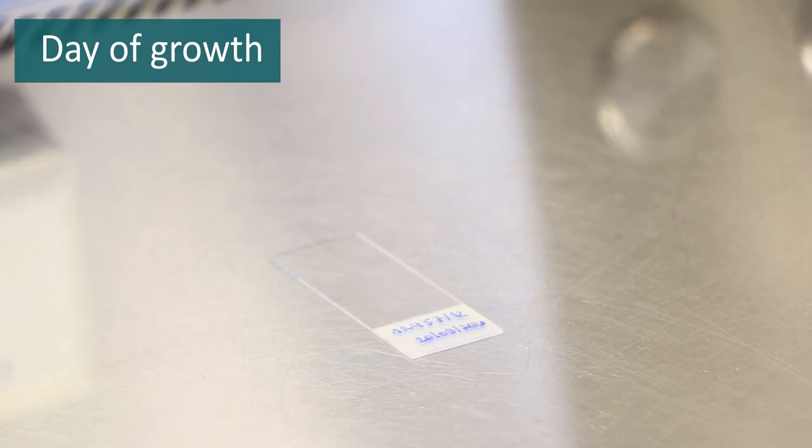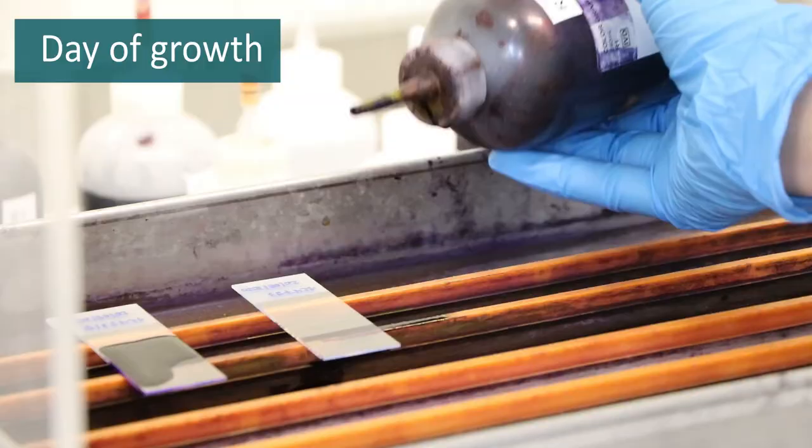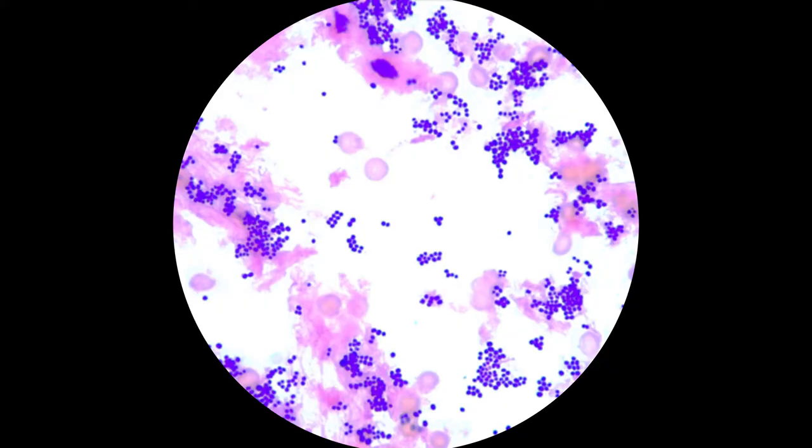How is a gram stain made? One loopful of the blood culture broth is smeared on a microscopic slide in a biosafety cabinet if available. Next, the slide is fixated and stained. The result is read with the microscope.